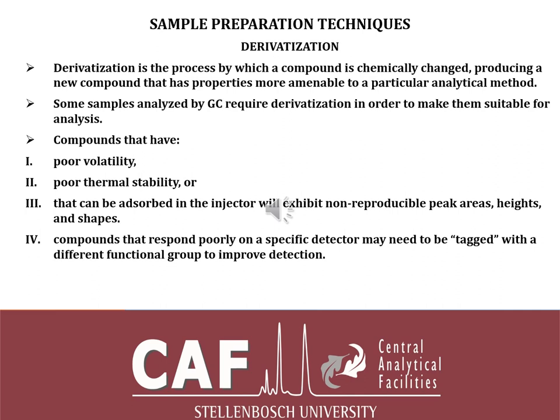Now, a little bit more about derivatization. Remember, I mentioned on-fiber derivatization when I was talking about the SPME and also the SPE. Just a little bit more about derivatization. Derivatization is the process by which a compound is chemically changed, producing a new compound that has properties more amenable to a particular analytical method.